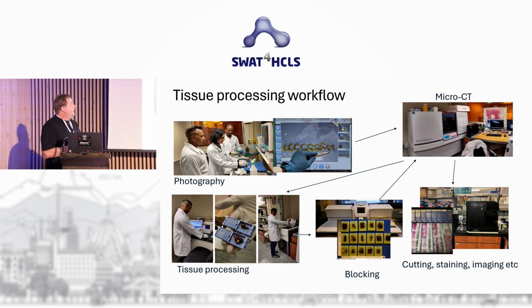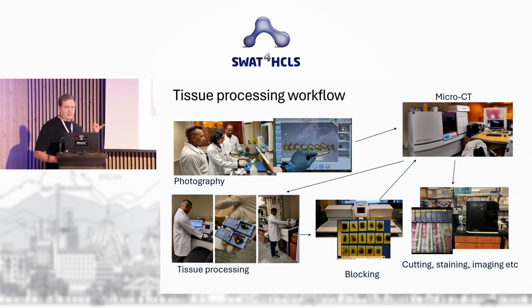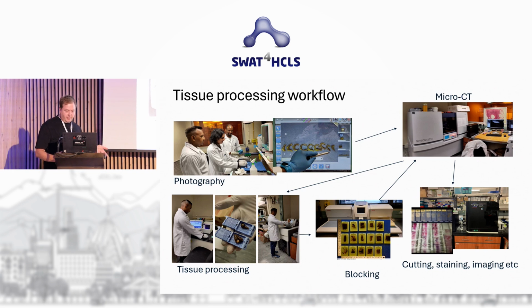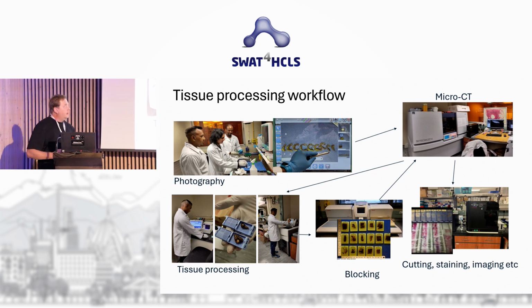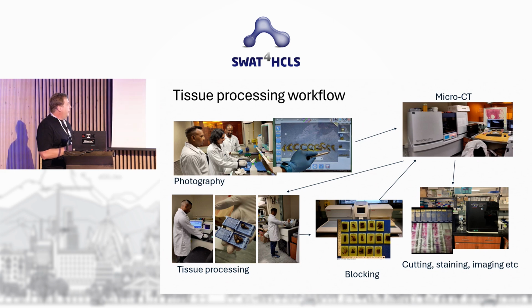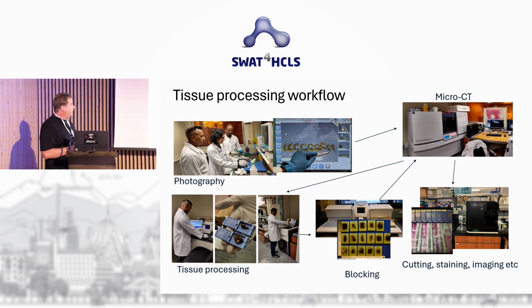After the samples have been labeled, they can be scanned by the micro-CT scanner. So we have a micro-CT scanner which allows us to look at the tissue in 3 dimensions. This is what I do most of the time, and I ended up landing in this role as well. Then the tissue is cut up into smaller samples and blocked and converted into these wax blocks. The blocks can be scanned again, depending on what we want to do.